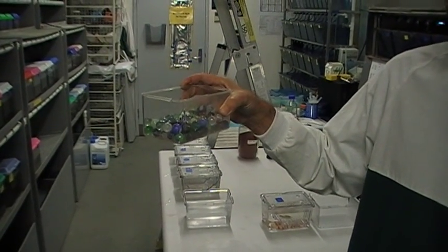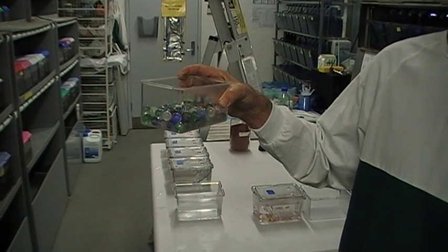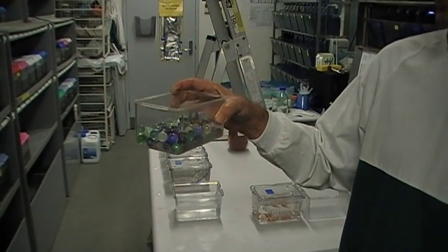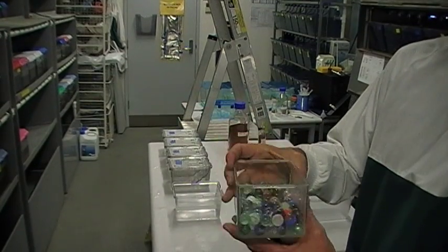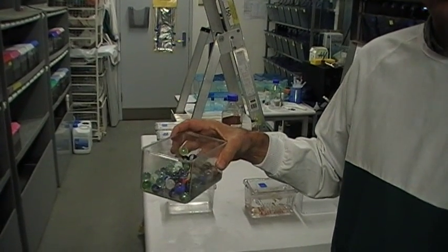So what we do is we put this little box of marbles into the fish tank and then when the fish lay their eggs, they'll do it here and then we filter off the water and we can get the eggs from there.